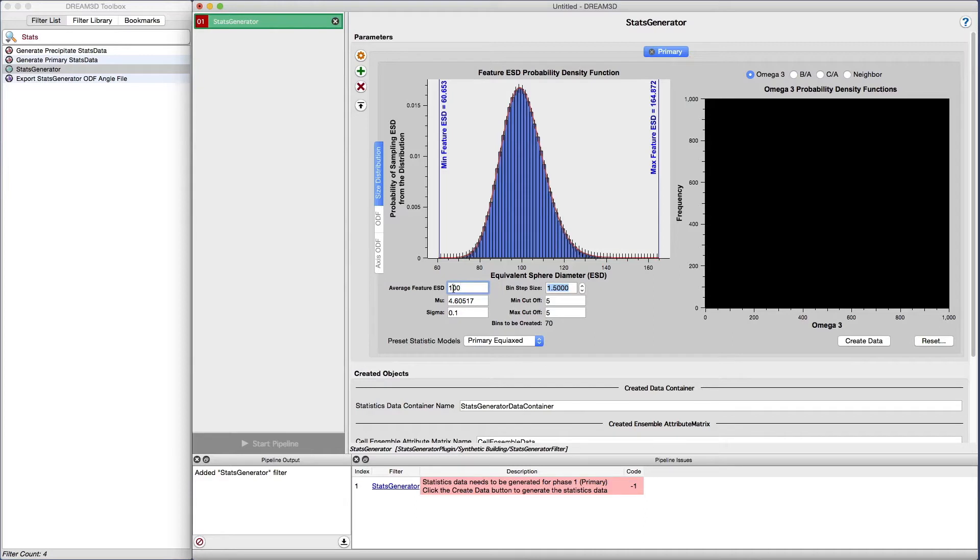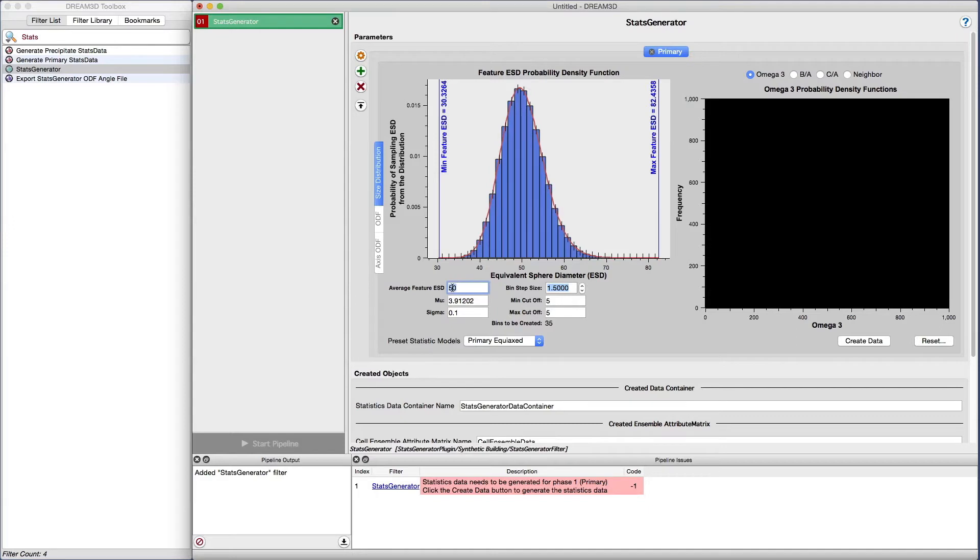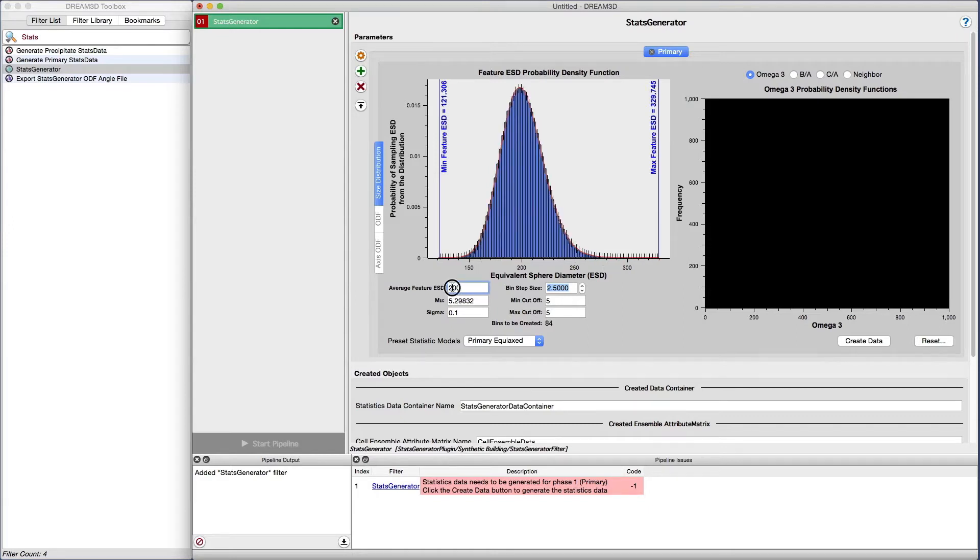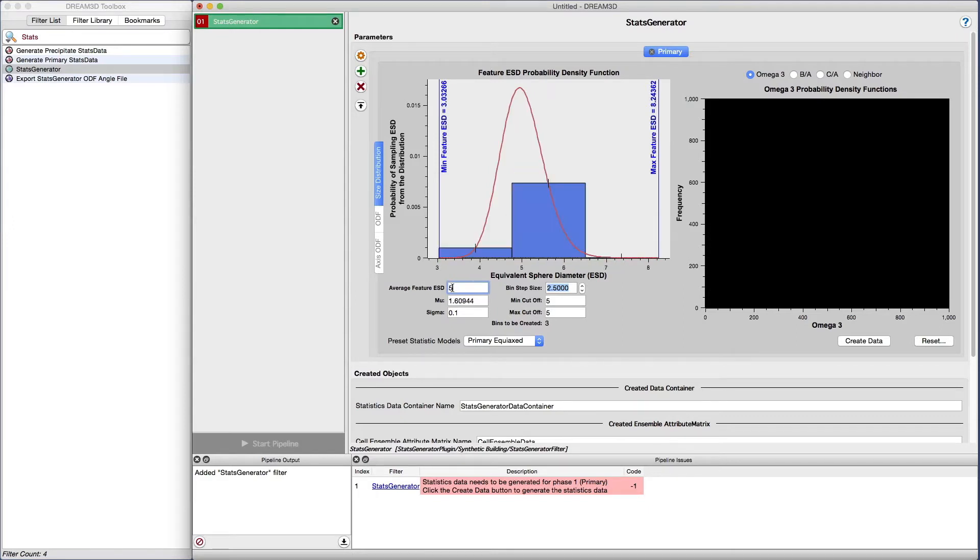Let's enter a few other values to see how the values will change. Let's try 5, and then 50, 200, and then back to 100.